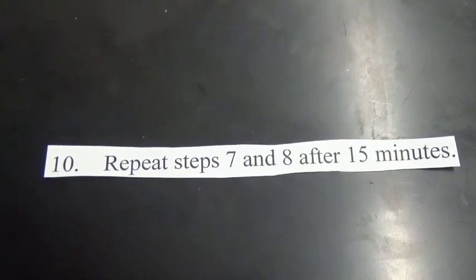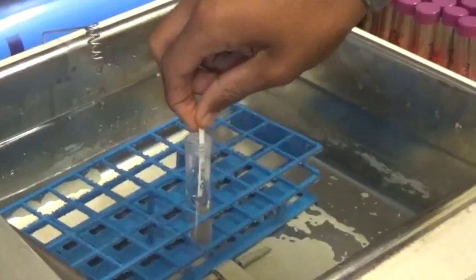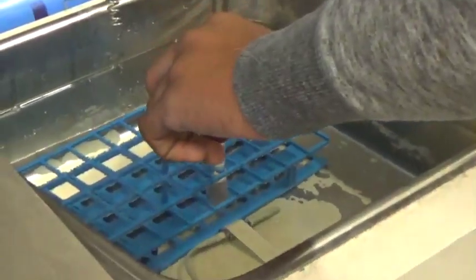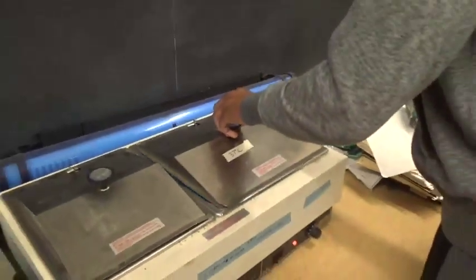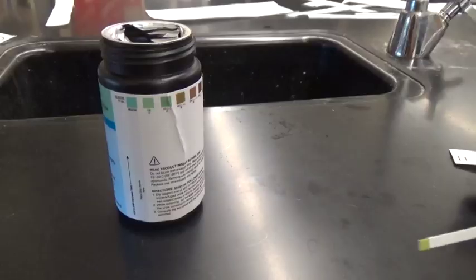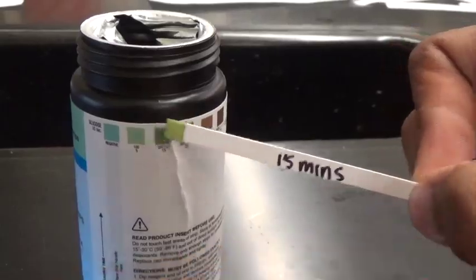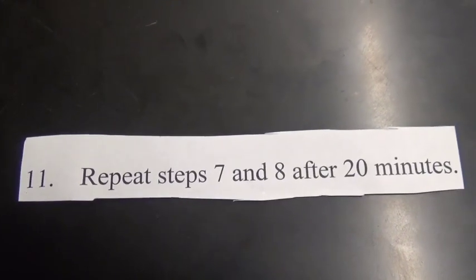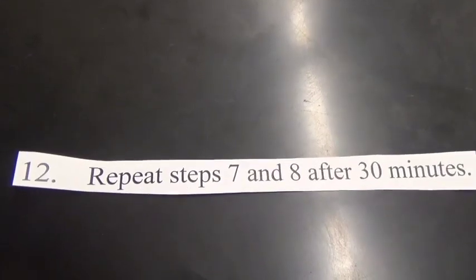Number ten. Repeat steps seven and eight after 15 minutes. Number ten. Repeat steps seven and eight after 20 minutes. Number twelve. Repeat steps seven and eight after 30 minutes.